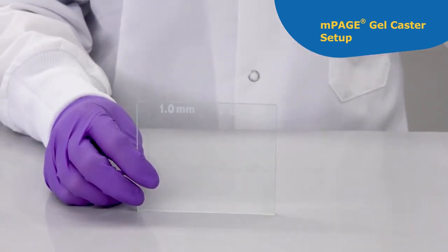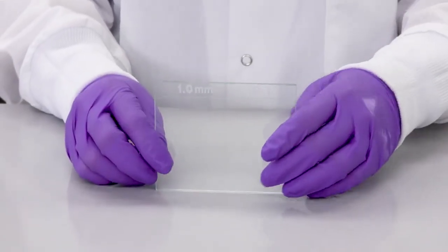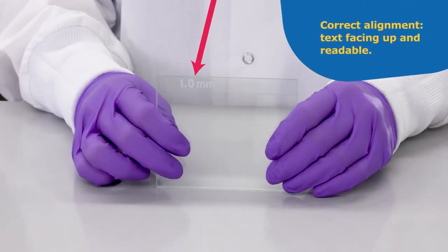Place the short plate on top of the spacer plate to form a cassette. Orient the spacer plate so that the text is up and readable.